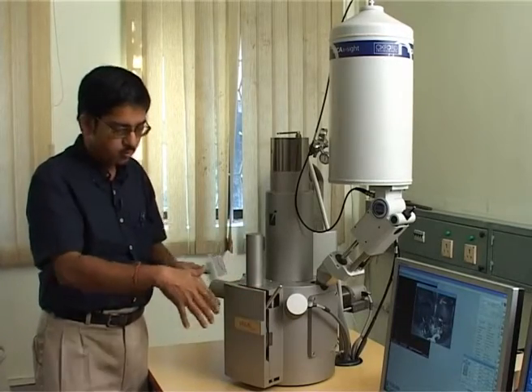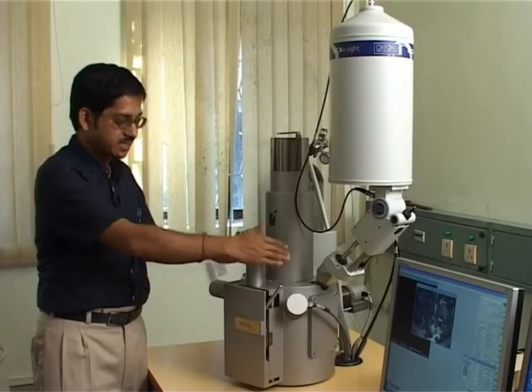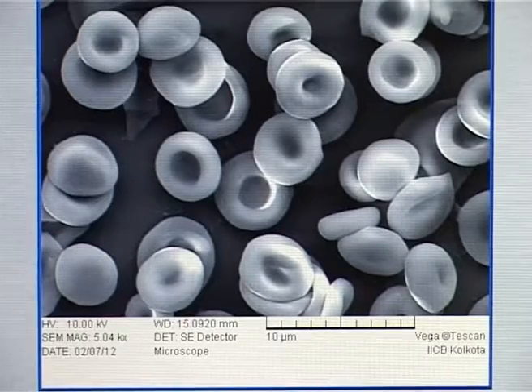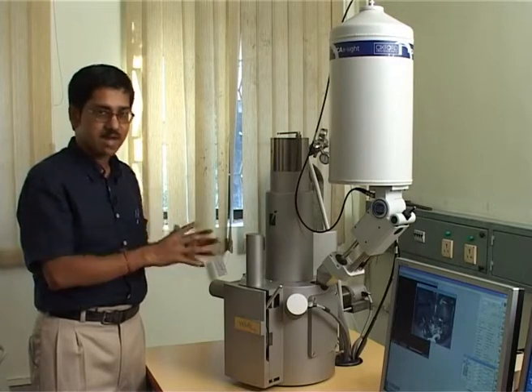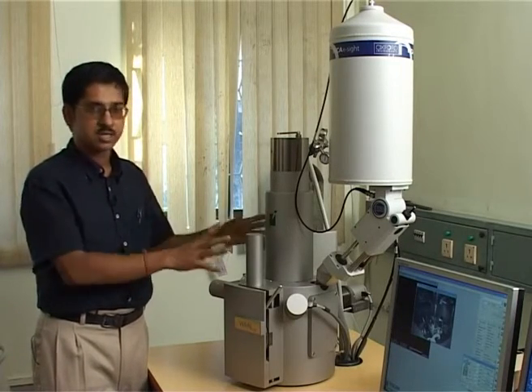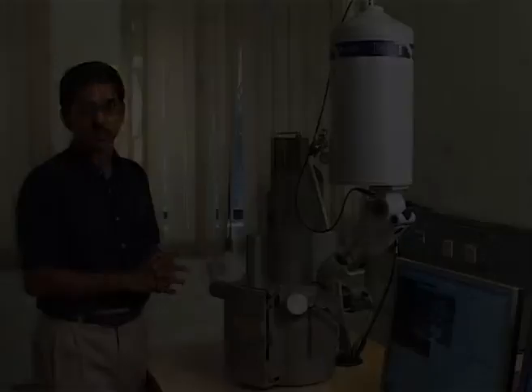So this is, you open it and place the samples here, and once the electron gets scattered, these are detected by the detector placed here, and it feeds to the software in the computer so that one can see the image. Furthermore, another important component of such an electron microscope is the vacuum, and there are high speed turbo vacuum pumps associated with this machine, which maintain the high vacuum in the system.